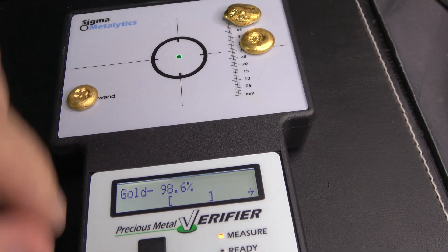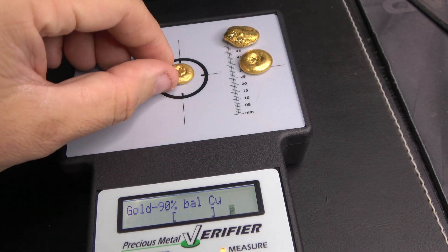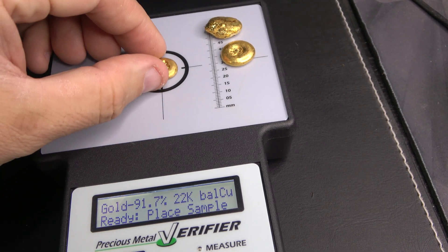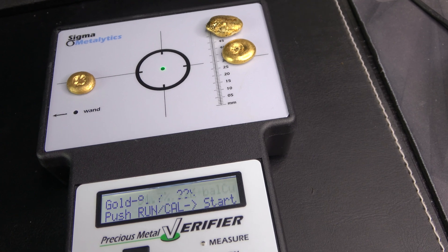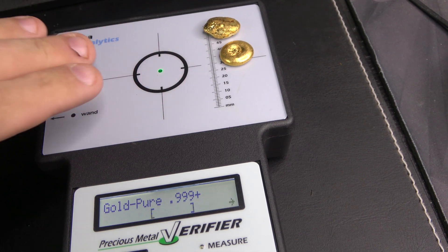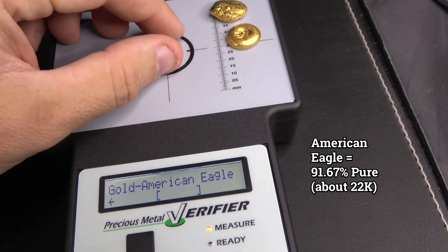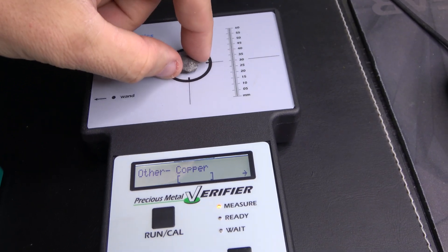Let's step it down a little bit, maybe to 90% balanced copper. Nope. Let's try 91.7 which is 22 karat. Not quite, so still a little more pure than that. Definitely not three nines plus. We'll find it here - maybe the equivalent of an American Eagle. Yep, somewhere around the purity of an American Eagle.